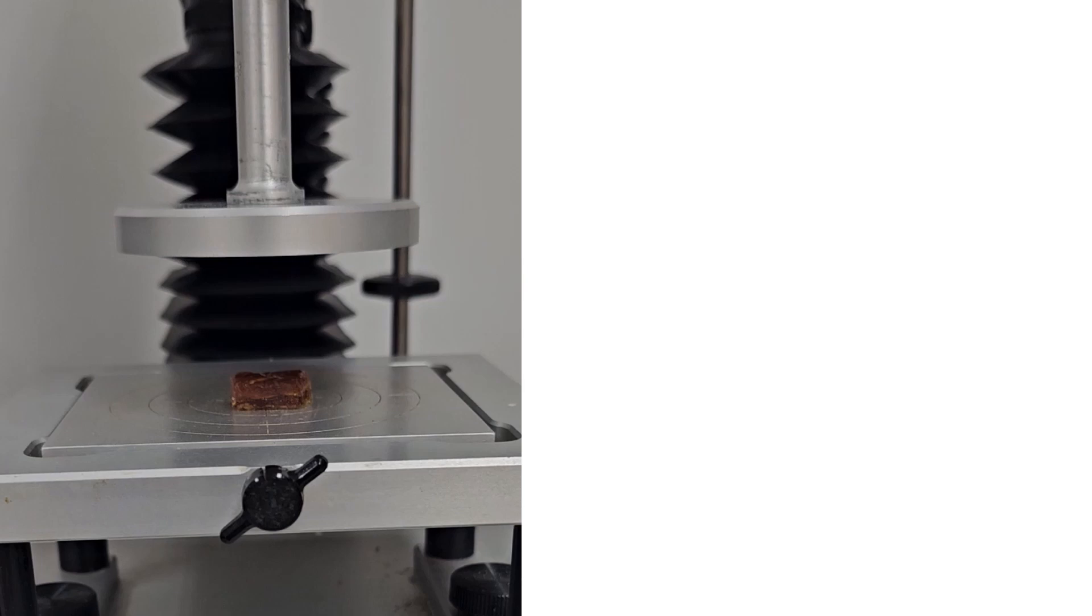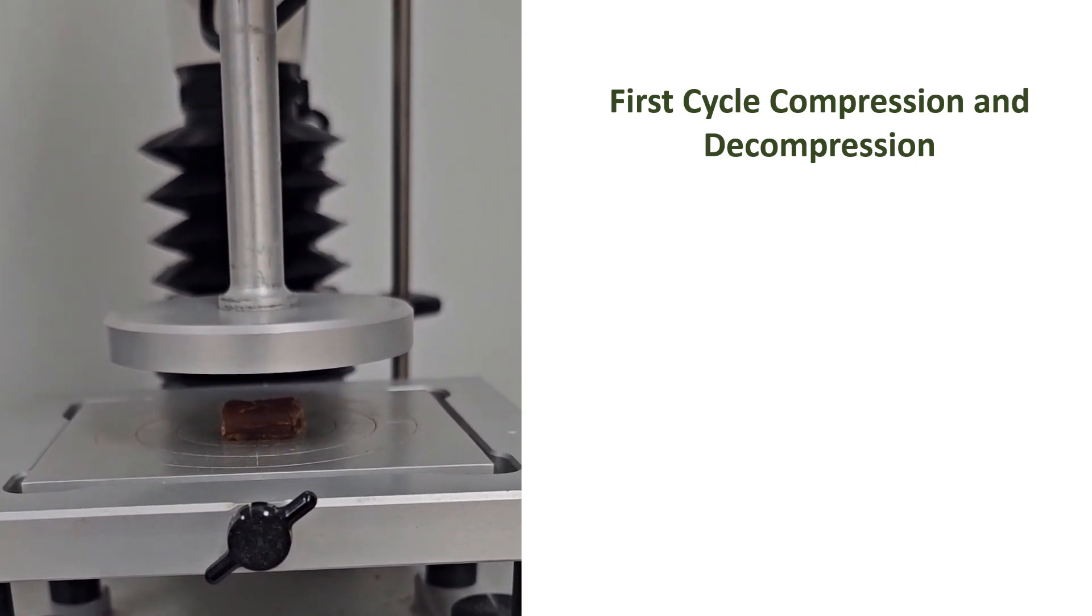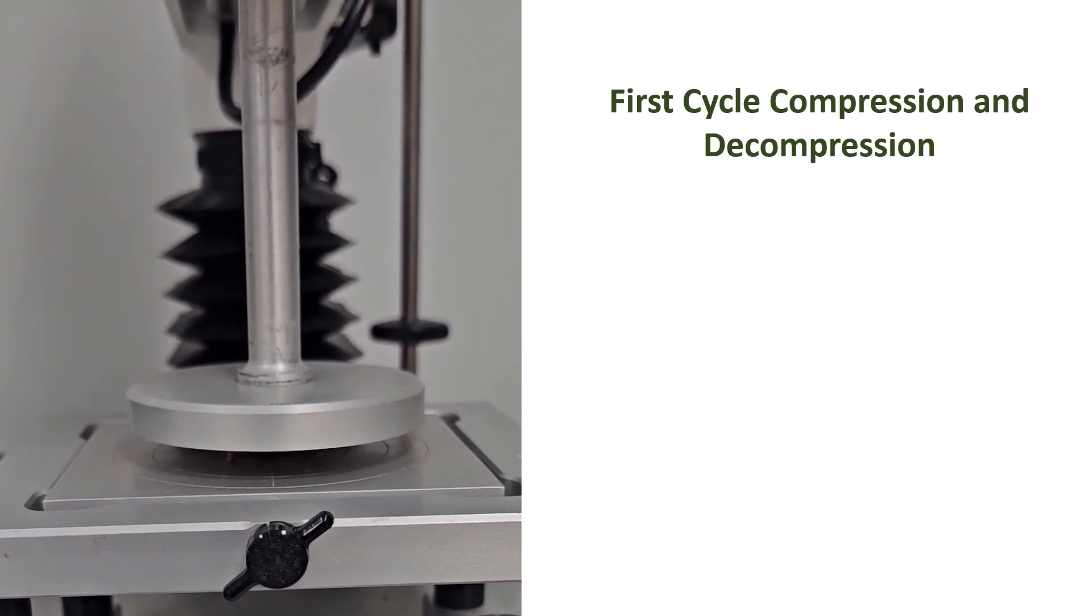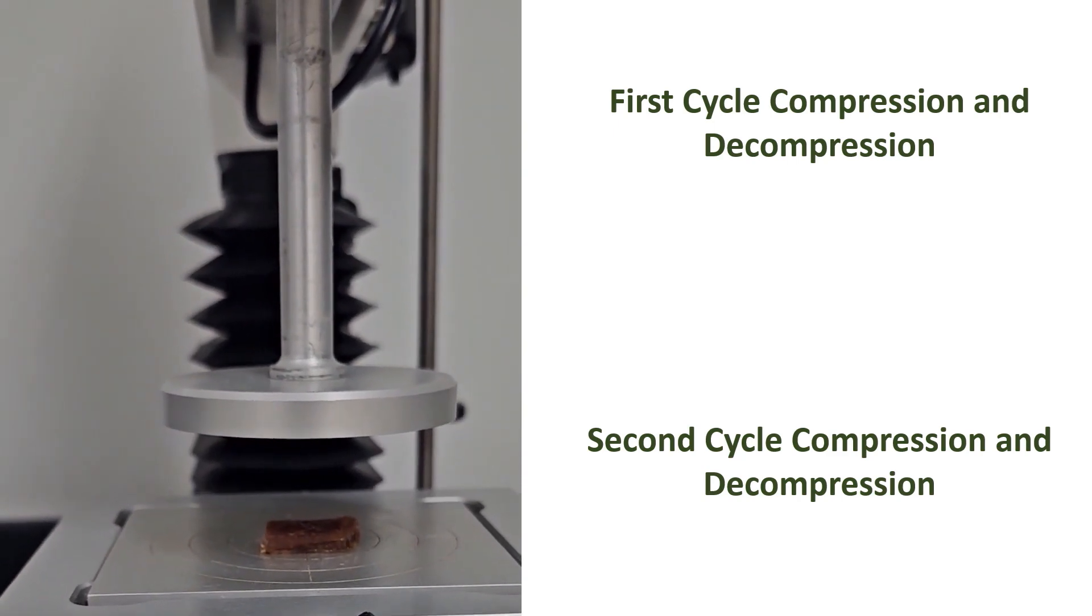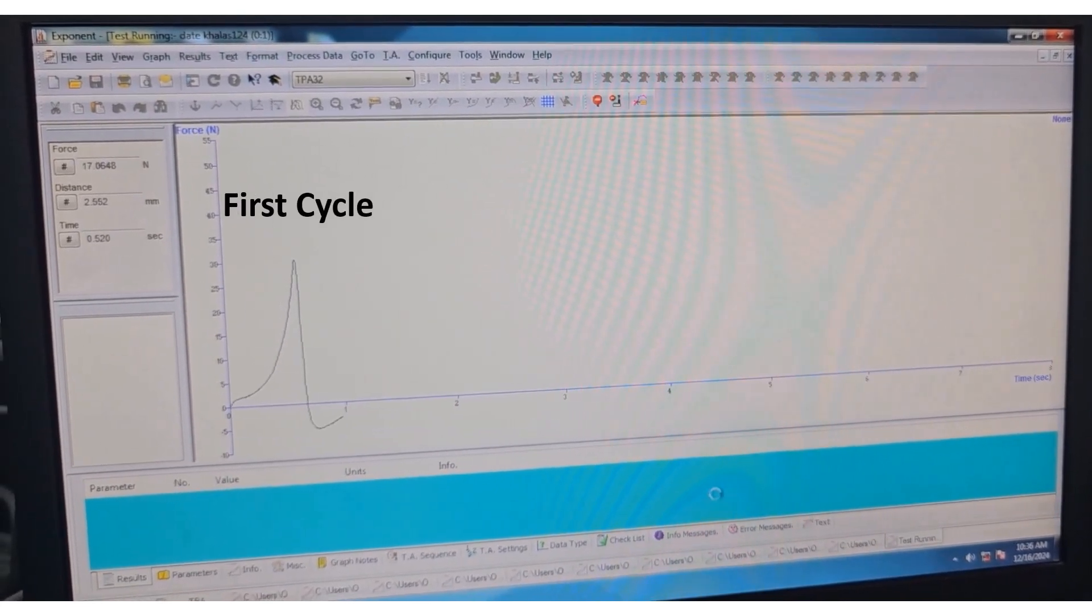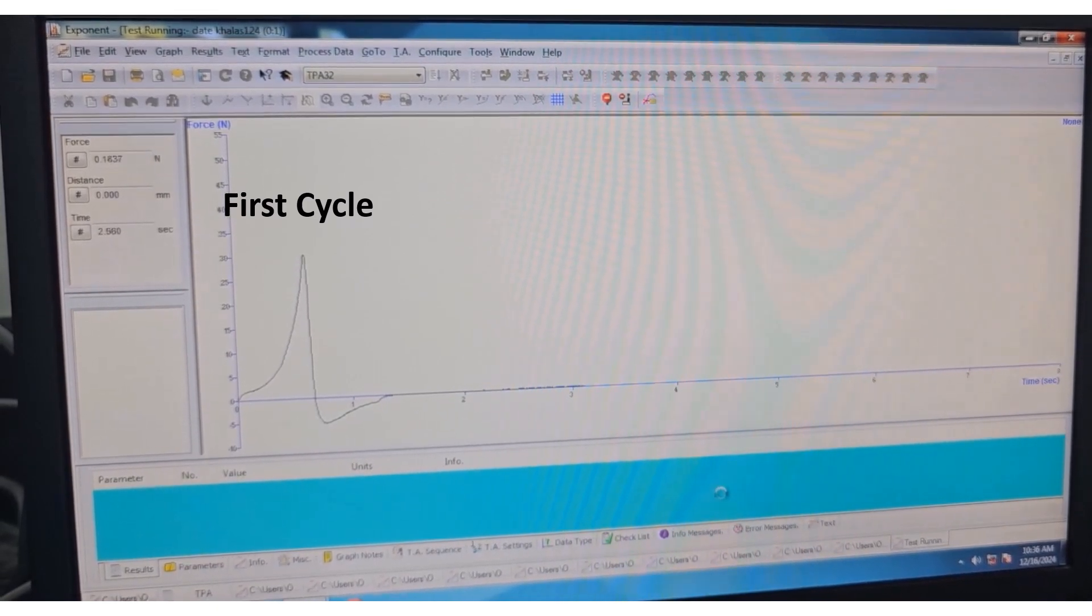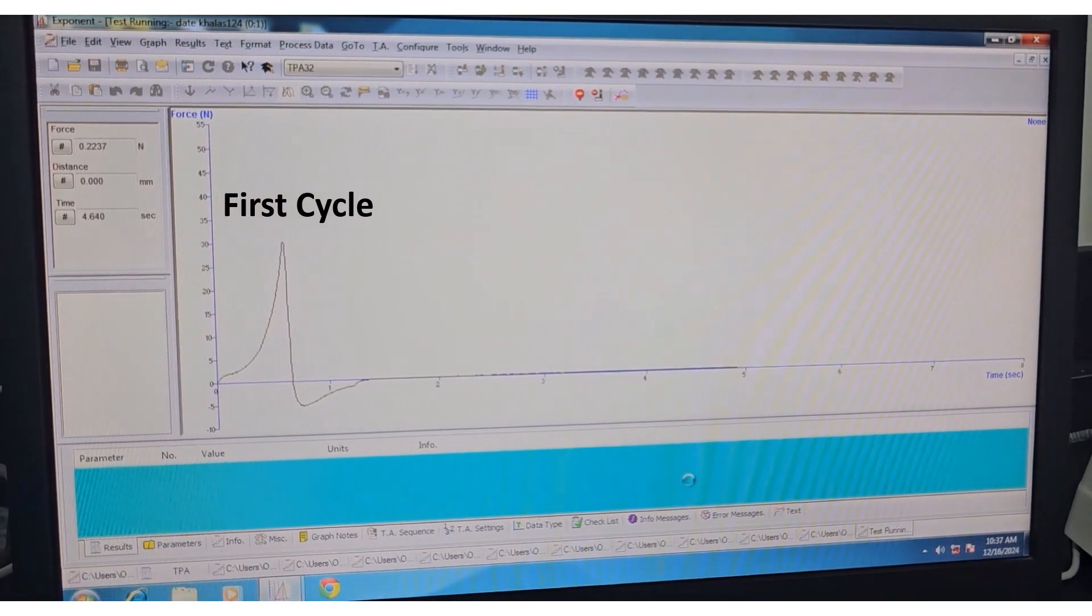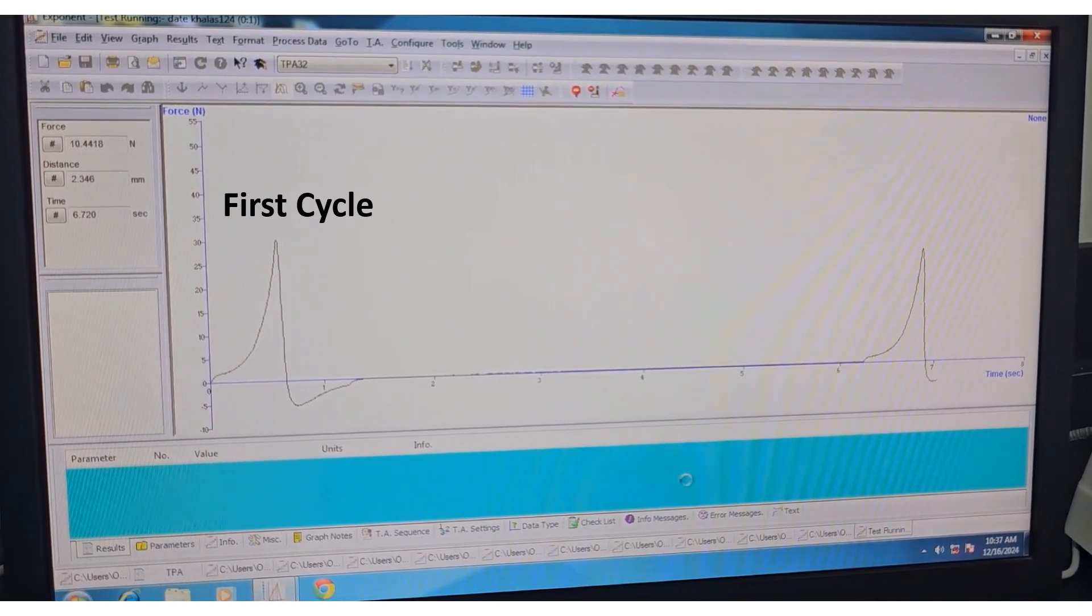First cycle compression and decompression. Second cycle compression and decompression. The force-time or force-distance graph is automatically shown on the computer. First cycle completed, holding, second cycle completed.